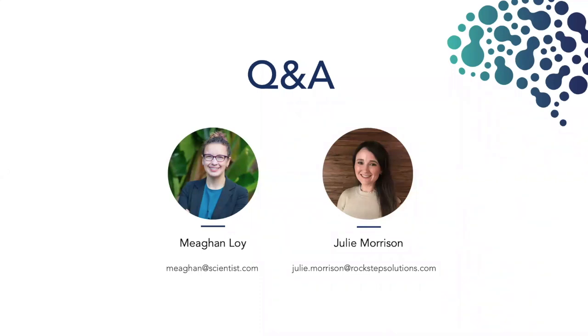Just looking at our questions here. All right, so how do you determine recommended spacing between collections? I think that's a Meaghan question. Definitely, thanks, Julie. So recommended spacing for collections has to do with a couple of different things. And one of those things is your technicians and their comfort level and how many hands you have on deck.